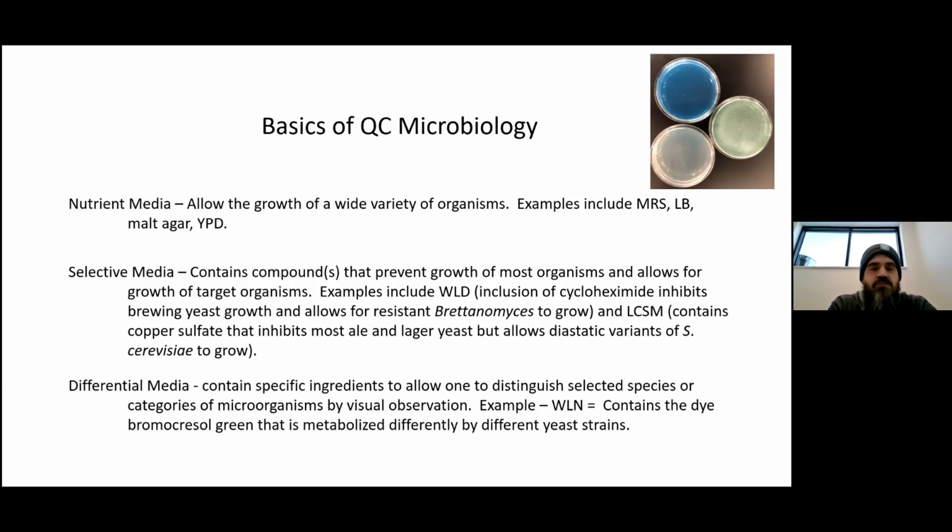Finally, there's differential media. This usually contains something that allows one to distinguish between microorganisms by visual observation. And I've got a couple of really good pictures of what I mean by that. A good example of that media is WLN, which is similar to WLD. They're really the same thing, except WLD has cycloheximide in it. So WLN is WLD without cycloheximide.